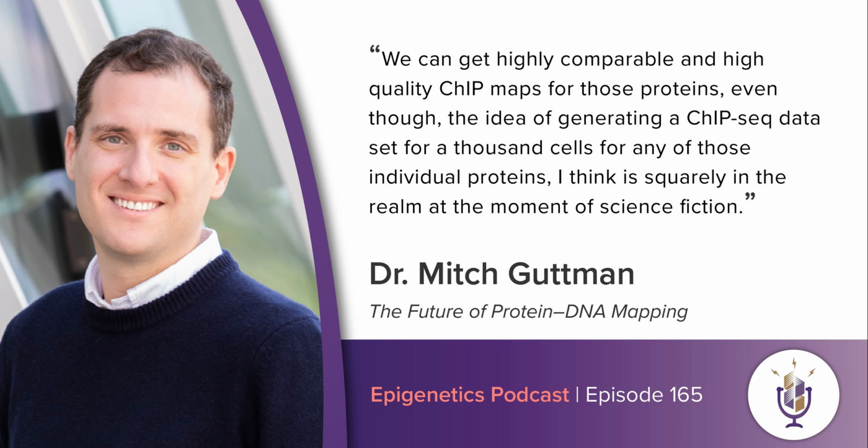That includes methods that we've developed for using split-pool methods for single cell DNA mapping, split-pool methods which we published a few years back for 3D mapping, and split-pool methods for doing RNA and DNA simultaneously, which we published a few years ago. And I think we talked about last time on the podcast looking at non-coding RNA localization in space, and really integrating this into a single, we'll call it modular structure, that would allow us to integrate and plug and play these different components together.